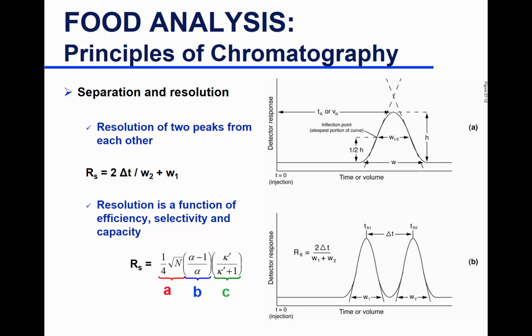So your sample or your molecule or compound, solute, whatever it is, starts spreading within the column. It goes from thin, and as it moves, starts interacting with the column, starts diffusing down and going in and out, it starts to grow bigger. You don't want it to get too wide. If it diffuses too much, if this becomes really wide diffusion, that means you have a problem with the resolution and efficiency of the column. You don't want it to spread too much. You want it to go in and out and equilibrate between your stationary phase and the mobile phase.